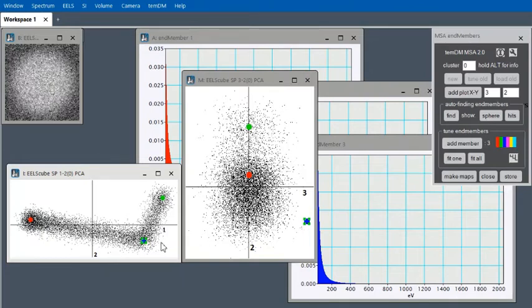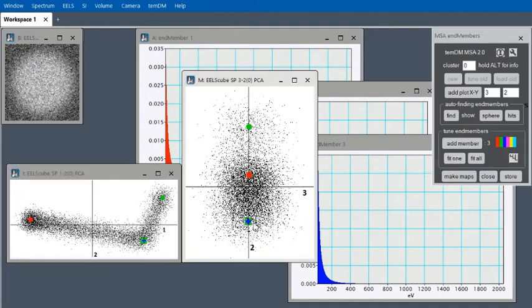So what to do? There is an extra semi-automatic tool to solve the problem. So you put it in the right position in the visible dimension and press fit 1. Up, in the invisible dimension, it jumps to a more or less reasonable position.